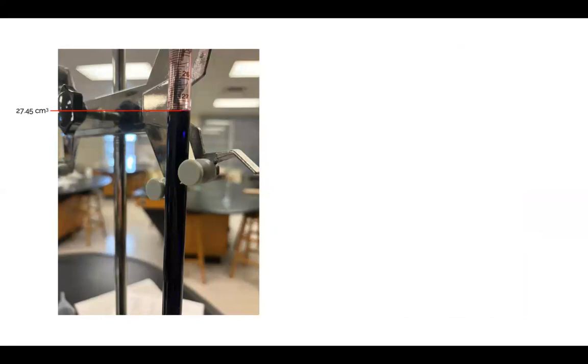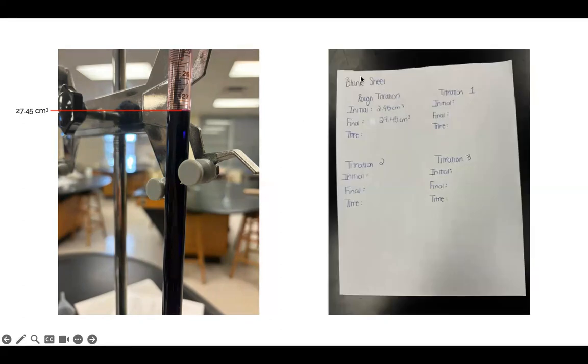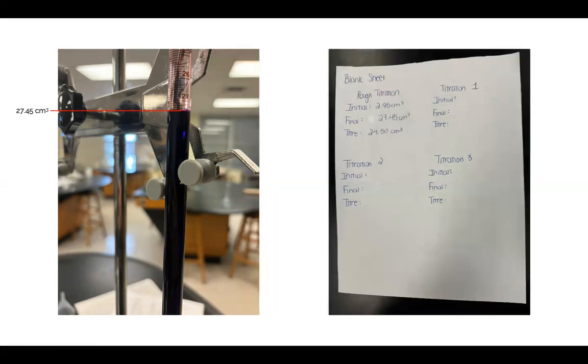Then you need to read the final burette reading. As you can see here, it's between 27.4 and 27.5. Even though it's closer to 27.4, because it's in between the two lines, it's going to end in 5. So our reading is 27.45 centimeters cubed, and you can note that on the blank sheet. From there, you can calculate the titer added, or the amount of Fa2 added, which is your final minus your initial. So we got 24.50 centimeters cubed for our rough titration.